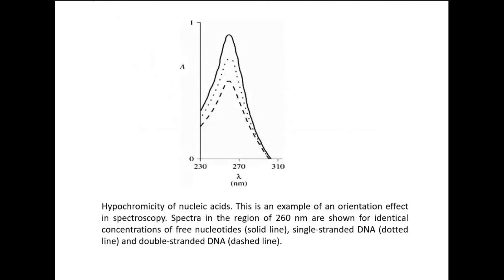If you want to quantify nucleic acid, you can easily quantify the amount of nucleic acid present in the sample of interest by using simple UV visible absorption spectroscopy. You have to take absorbance at both 260 and 280 nanometer. Not only that, the structural variation of nucleic acid DNA can be studied. Whether DNA is undergoing degradation or not can be studied, or what we generally call renaturation or denaturation of nucleic acids.